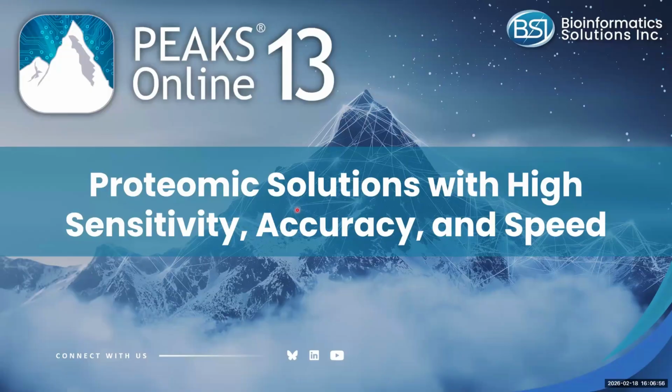So as Christina mentioned, I will be discussing Peaks Online 13, which is our proteomic solution with high sensitivity, accuracy, and speed.